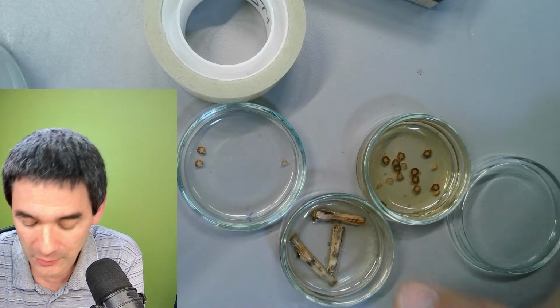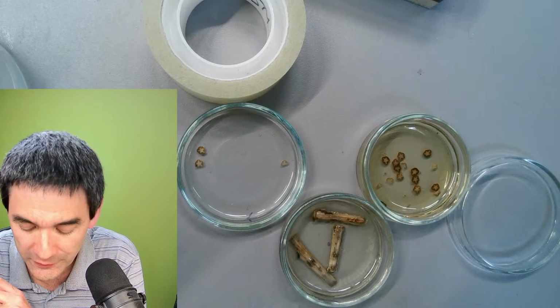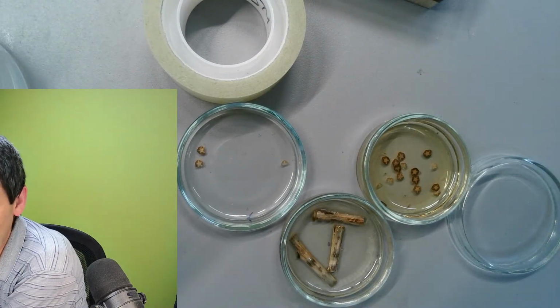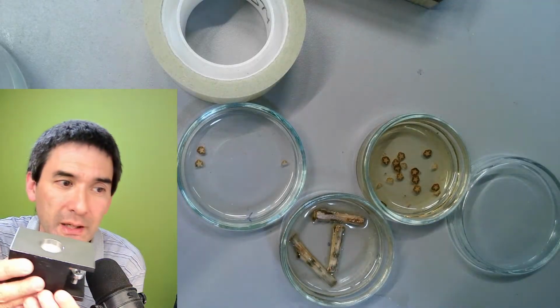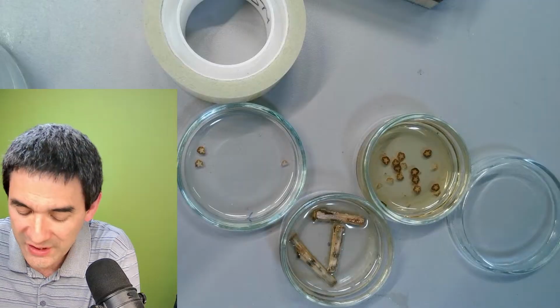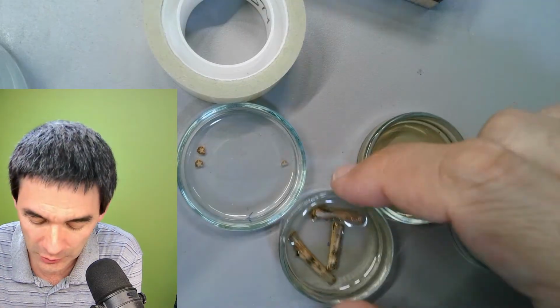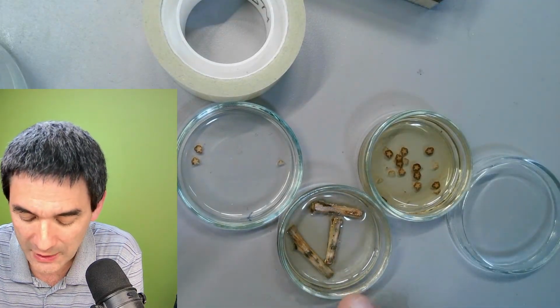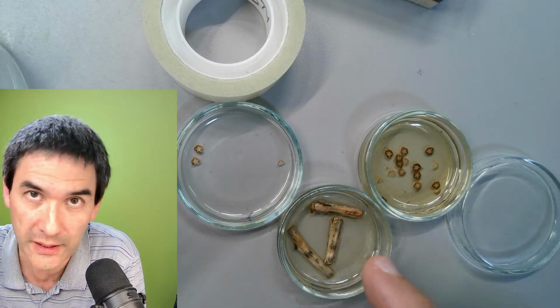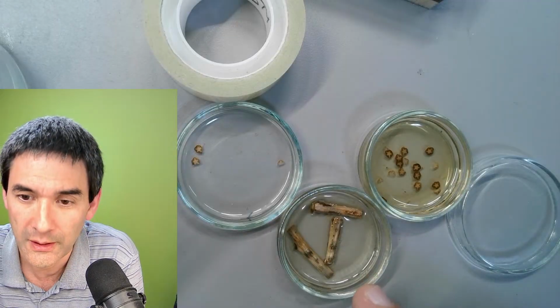And the problem is now how can I get the wood soft enough that you can actually microtome it, right? And you might already remember from a previous video this microtome here, right? But the problem is that the wood was extremely hard. So what I've done is the following. I've actually put it into glycerin. So this is 100% or 97% glycerol.